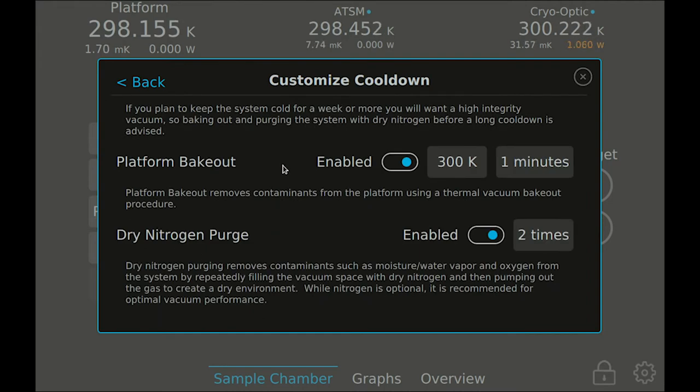The cool-down process will begin by checking your system for vacuum leaks while establishing a rough vacuum level that is needed for effective cryopumping. During the process of establishing a rough vacuum on the sample chamber, you can also enable the platform bakeout or dry nitrogen purge procedures to help clean out your system before beginning cryopumping.